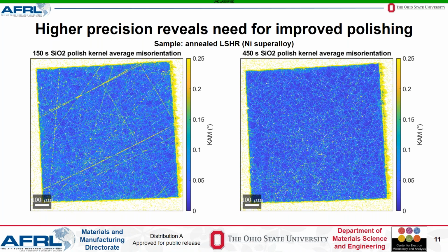That's actually an excellent question. I have not tried that so far. Again, I've just been using samples where the known level of deformation is very low, like the silicon wafer sample, various different silicon wafers, etc. That would be an interesting way of empirically determining how good it is. Let's see. Great. I don't personally have access to a neutron diffraction setup, sadly.